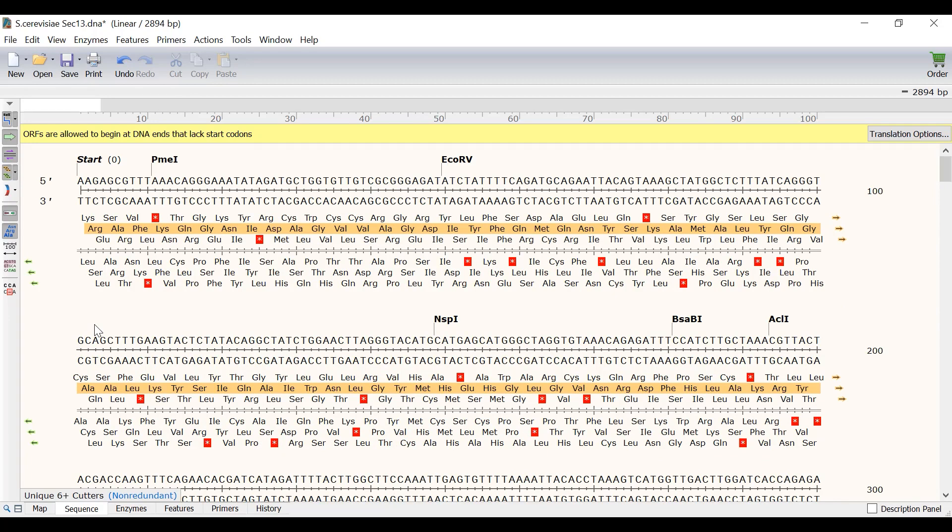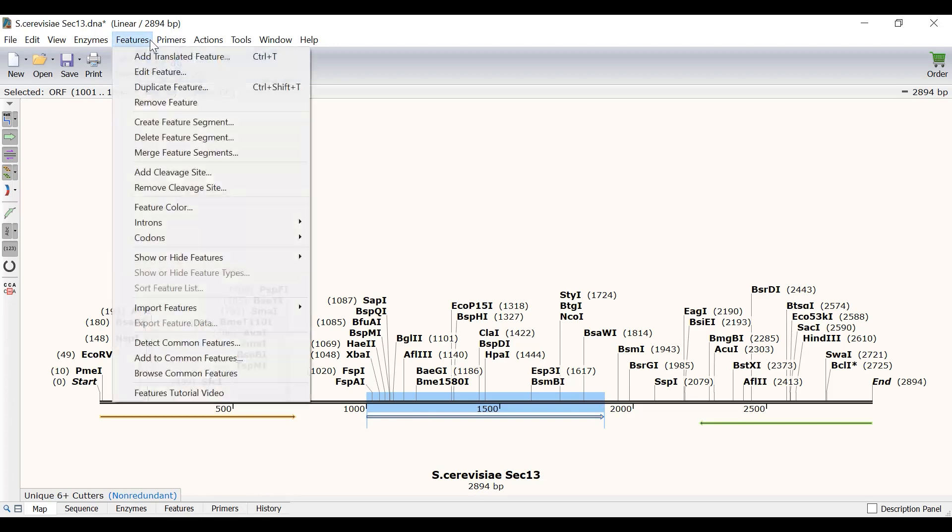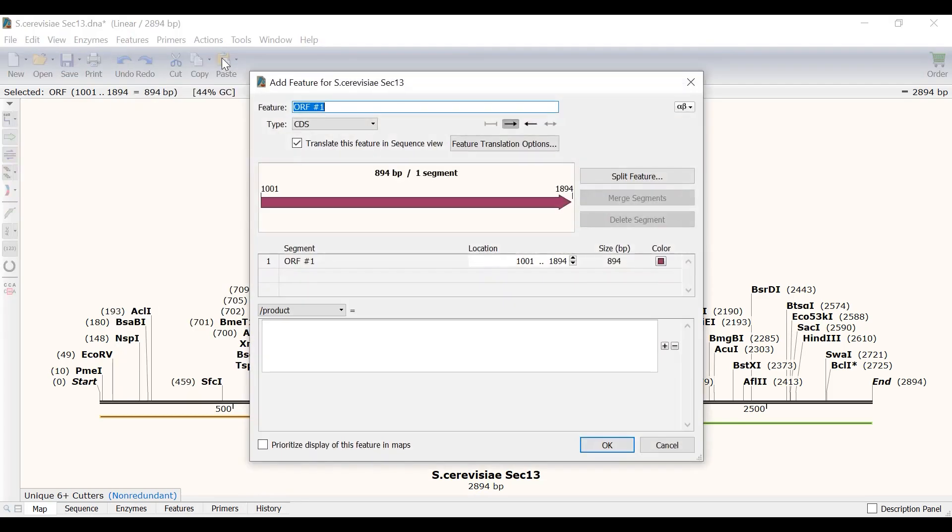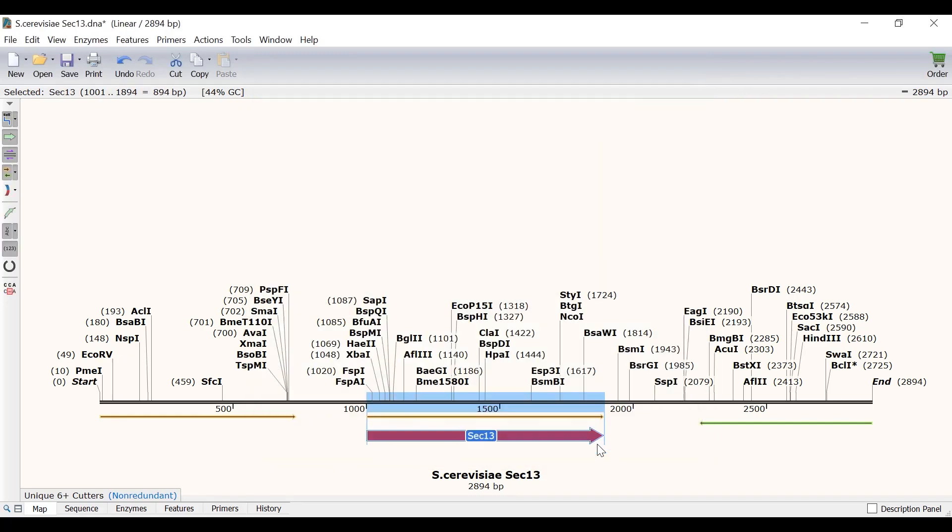For most purposes the best way to work with translations in Snapgene is to use the translated features. To demonstrate translated features I will switch back to the map view. I will then select the middle open reading frame which corresponds to the sec13 gene and I will go to features, add translated feature. I will call this translated feature sec13. Snapgene has already defined this feature as a coding sequence or CDS and this means it will be translated. Now I will click ok to return to the map.